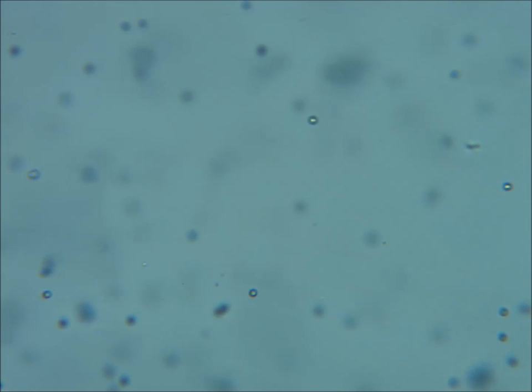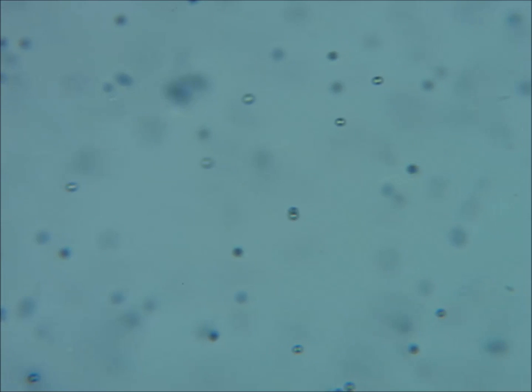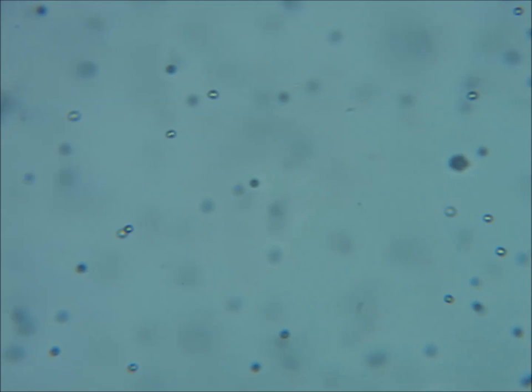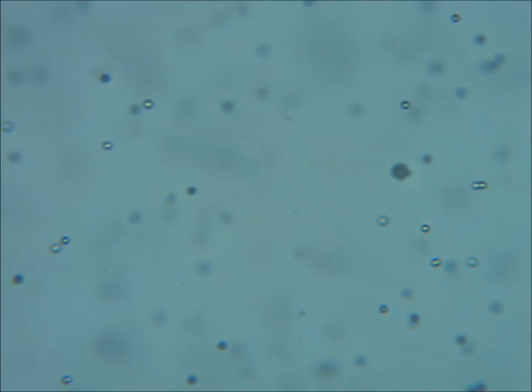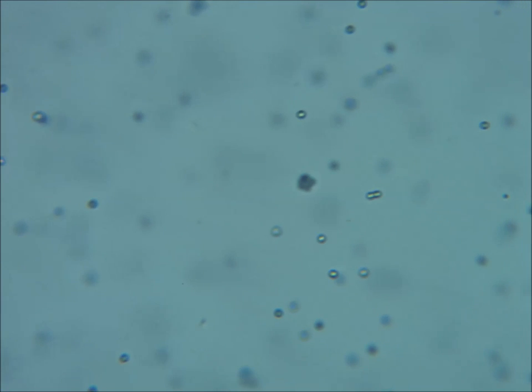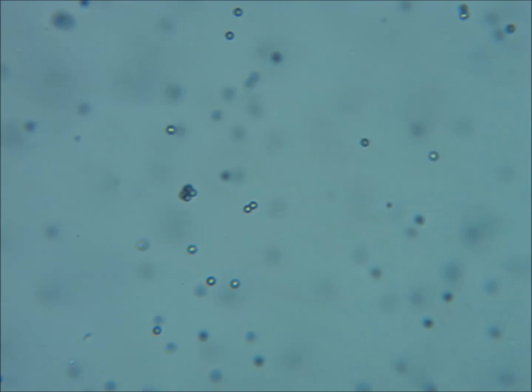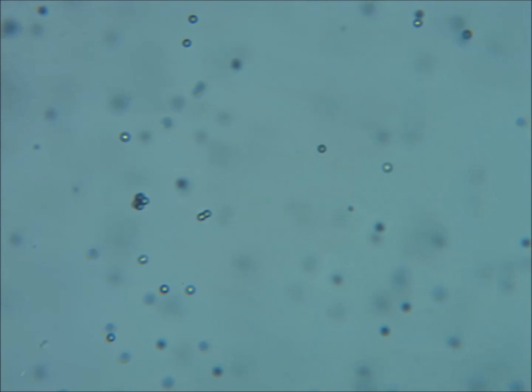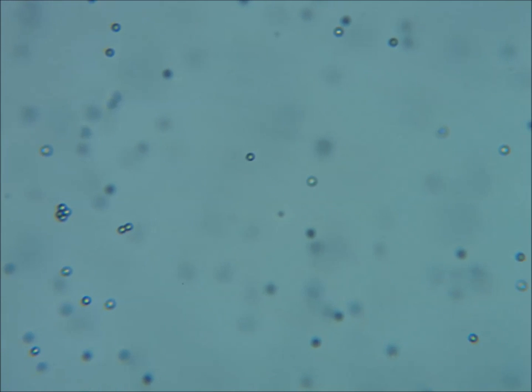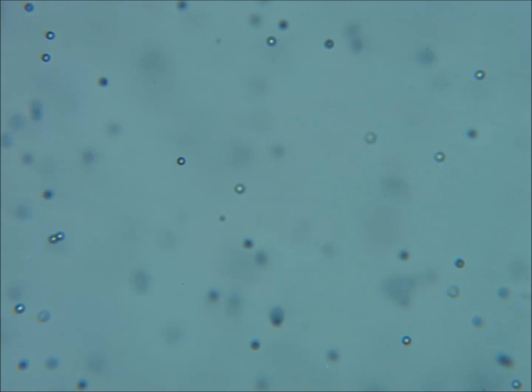Now here's an example of a mistake. This slide was not properly prepared, so we're actually getting flow of fluid on the surface of the slide. Hence we're not getting Brownian motion — we're just getting straightforward sideways motion of the beads. You do not want this. If you are seeing this kind of motion, first wait for it to settle down. If it doesn't, you'll need to remount the slide. We need them jiggling around largely in place. If they're moving in a particular direction, that is not Brownian motion.